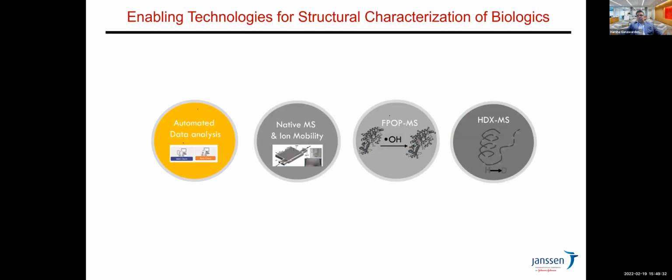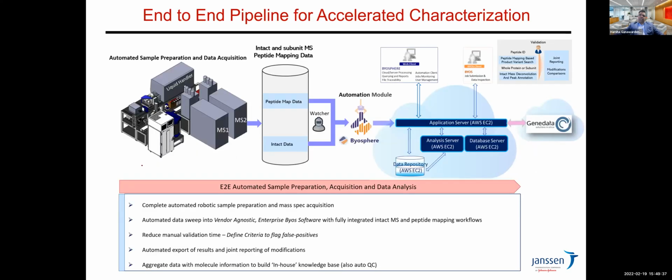First, I'm excited to show our fully automated pipeline, which has been a key success story in our lab's ability to deliver on the rapidly growing number of programs. The end-to-end automation includes sample preparation, data acquisition, data analysis, and aggregation happening in a seamless fashion with minimum touch time. As you may note, we have bridged sample preparation via automated robotic liquid handling and cold storage with mass spec data acquisition, which you rarely see in most labs.